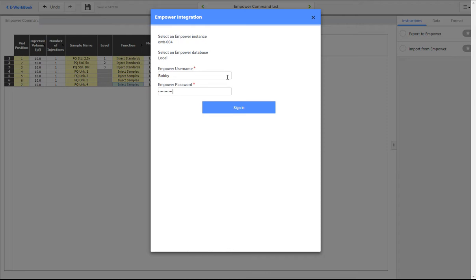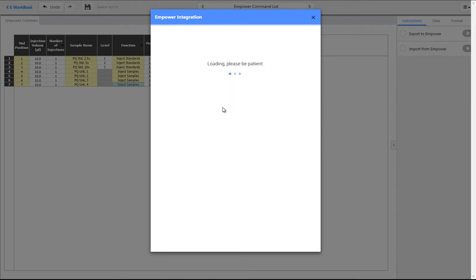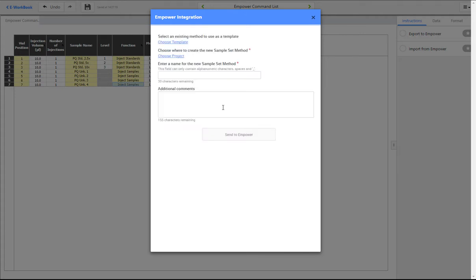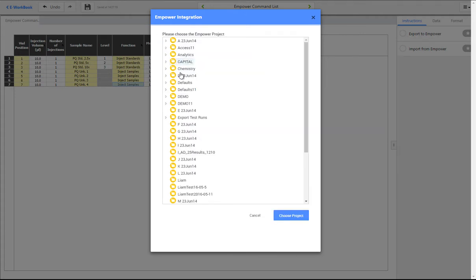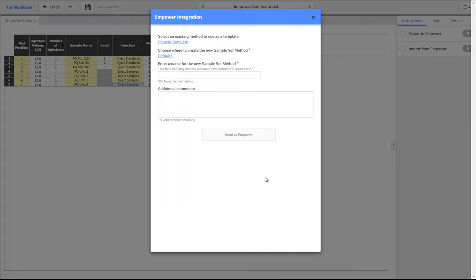If required, most of this information can be hard-coded in the integration definition files to streamline this process. The list of available mPower projects is defined by the user permissions of the mPower account.